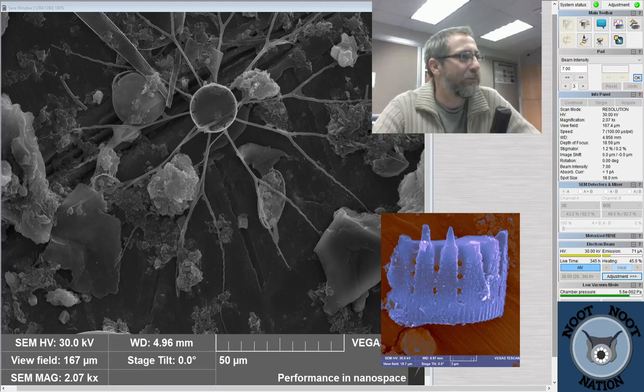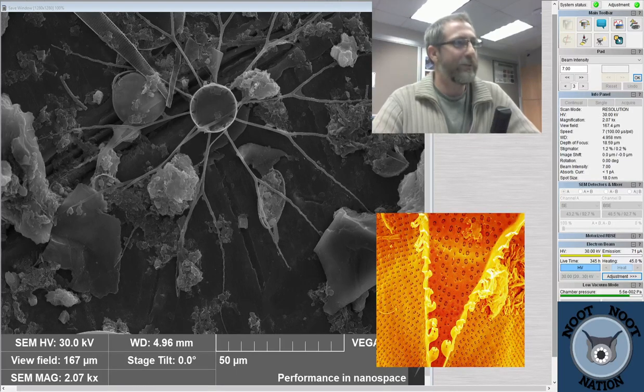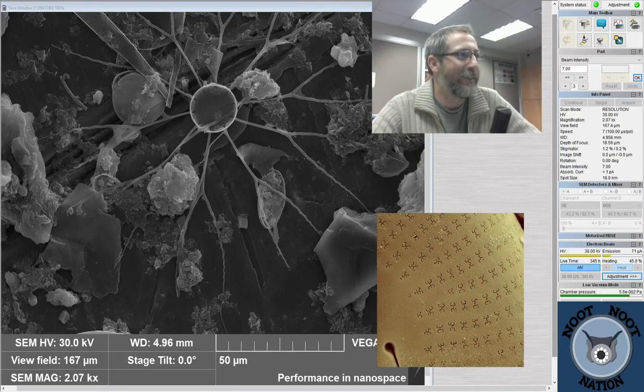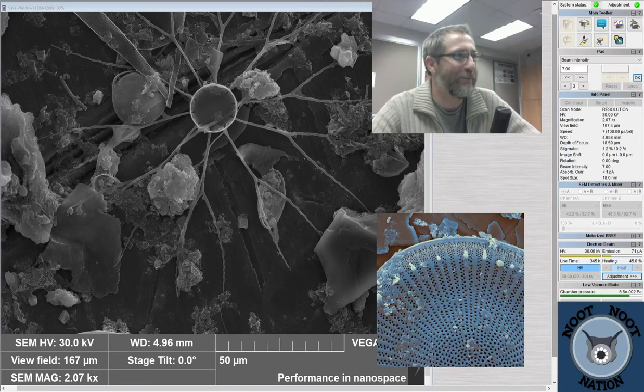Right, I think I got a photo. Hopefully you'll like this one. Making science accessible is part of my goal here in the channel. And they're not roots, they're setae, little hollow spines that they put their chloroplasts into to get access to more light. So it made me run from the kitchen to look at a diatom. That's the way I like to have people, running from their kitchen to see what I'm doing.